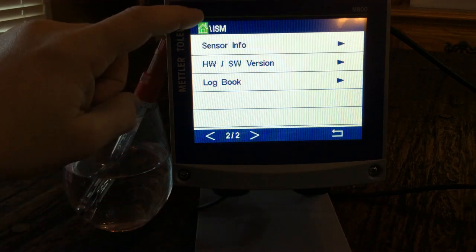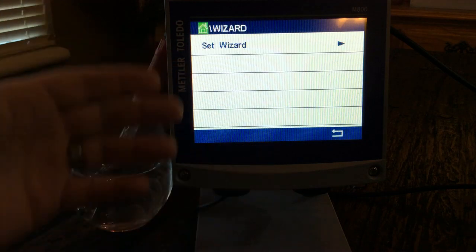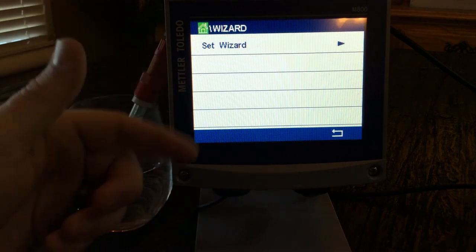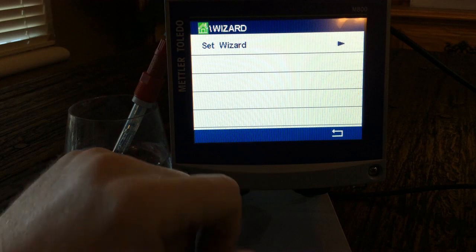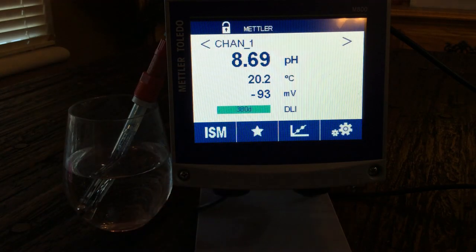At any point, if you want to get back to the home screen, just hit the home button. The favorites tab lets you set up a quick reference — hit favorites, then navigate to calibrate. It makes things simple and easy, and you can do your sensor calibrations right there in the field through the transmitter.